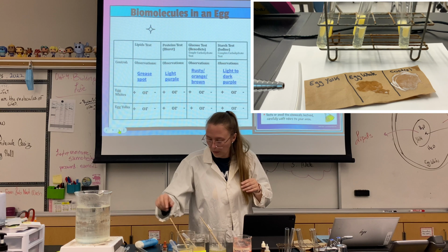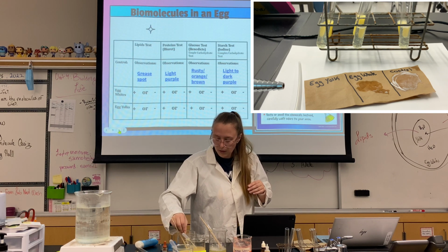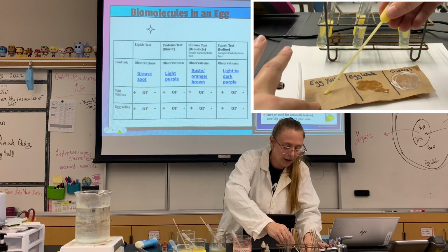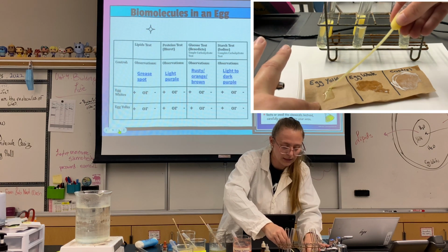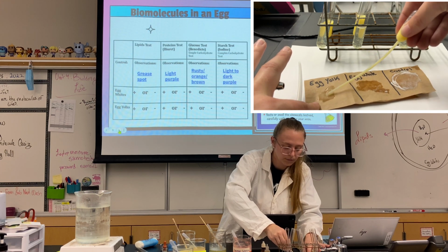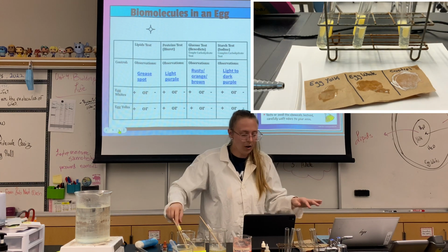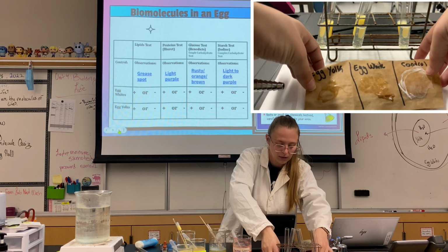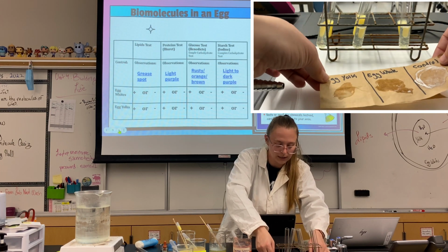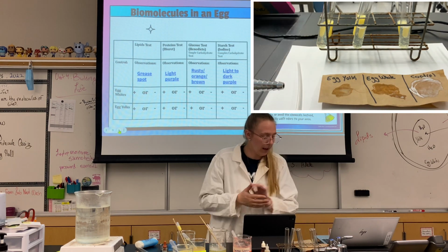And then we're going to do it with our egg yolk. So this test doesn't work all the time. It's not the most scientific test, and it's kind of hard to see which one leaves a grease stain. So we'll let that sit and see what we get.